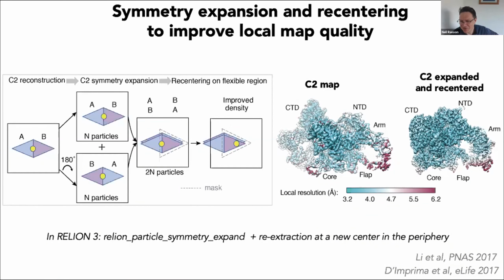And then the last question is, again, a biological one. Very nice talk, thank you. It is from Alessandro Borsellini. Is there a reason why you didn't use the iodinated TG to actually see where the hormones are formed? Yes, so this is in the plans. Initially we wanted to have much more homogeneous thyroglobulin. If you extract this from natural sources and from patients, it's always partially iodinated.